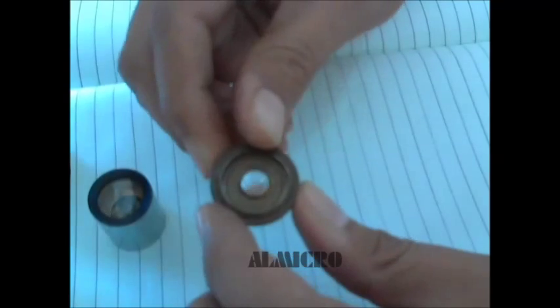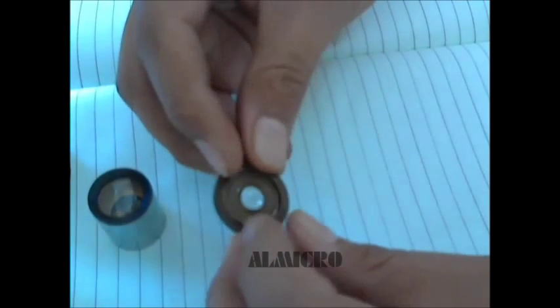Just hold it like this. You can open it. Just keep it aside. See, this is the cover lid kind of thing. There is a lens in between and we need to clean this lens.